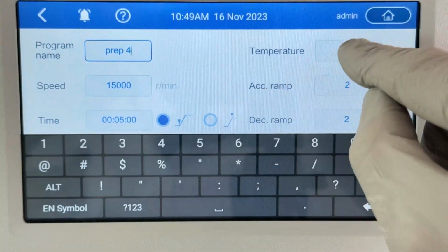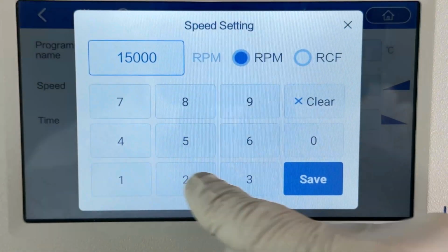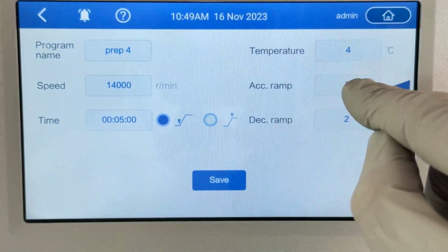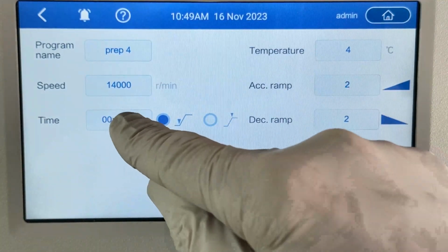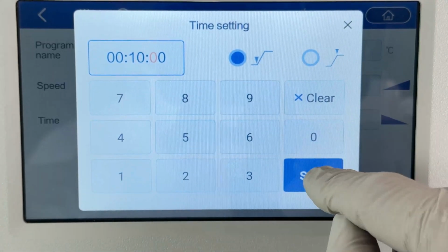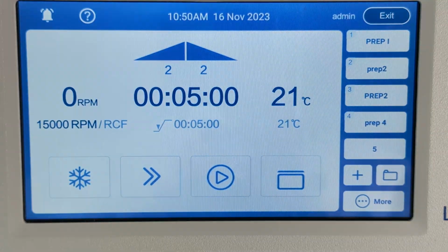4. Temperature, we'll put that to 4. Speed, we'll change that to 14,000 RPM. Acceleration, deceleration 2, and we'll change that to 10 minutes. Okay, and there we go, saved, and Prep 4 is now in place.